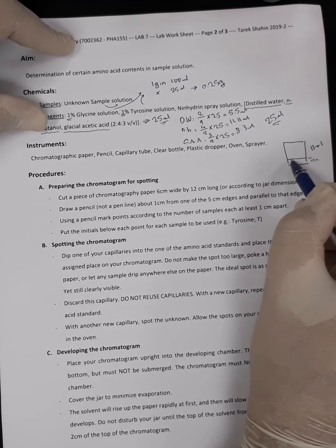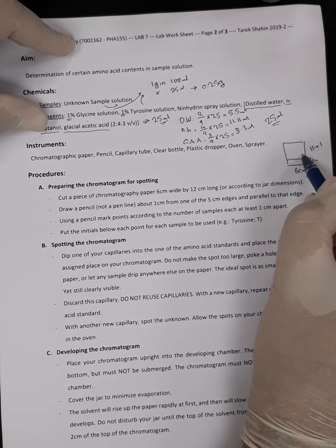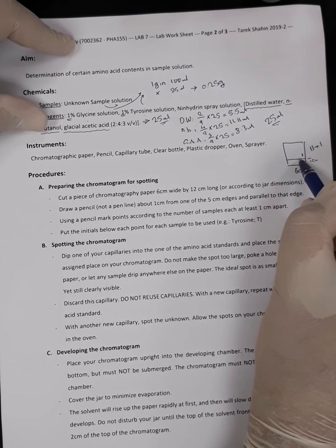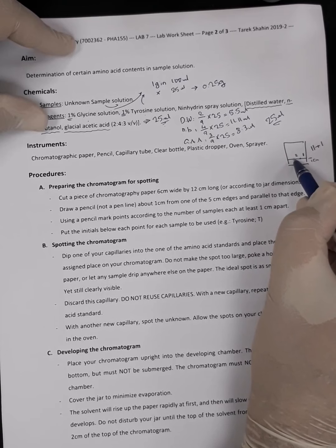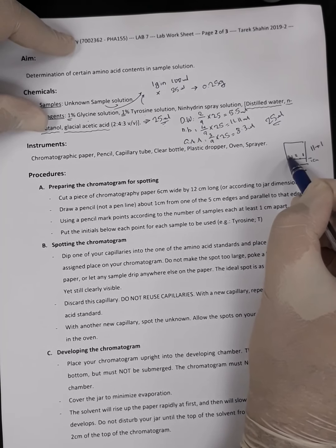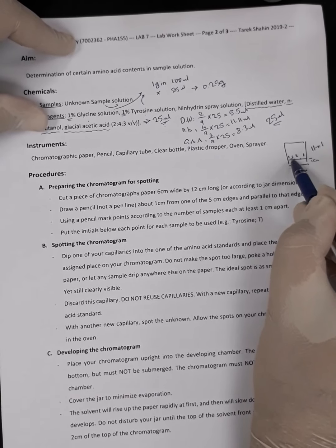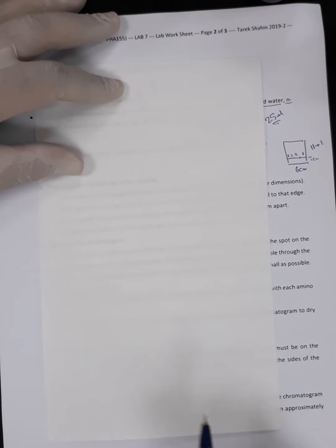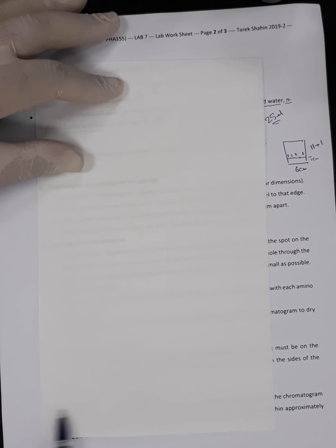How are we going to specify where the spots are? We will keep 1 centimeter from this margin, and then we will place the first spot, then we will keep 2 centimeter, second spot, another 2 centimeter, and then 1 centimeter between the last spot and the wall. To make it clearer, I will explain it here. Here I will draw the baseline.